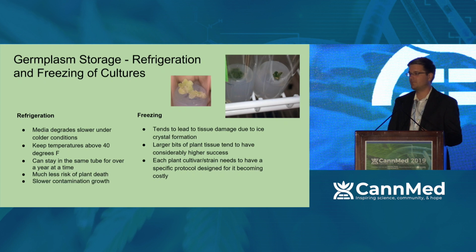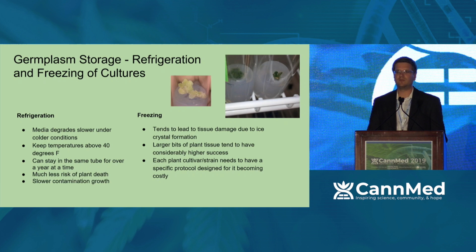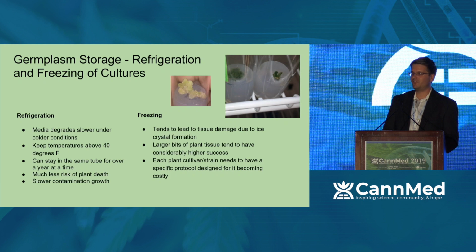The other one that a lot of people ask is, can you freeze these cultures, cryopreserve them, that sort of stuff. I have actually never personally tried cryopreserving cannabis tissue culture, but what I have found in all the literature is there's all sorts of issues with either freezing or thawing that causes the vacuoles to burst, and that causes a lot more problems in the long term for even trying this out. So whenever I'm starting somebody out in a lab or whatnot, I just recommend they go room temperature, no more than refrigerator, and just work with that.